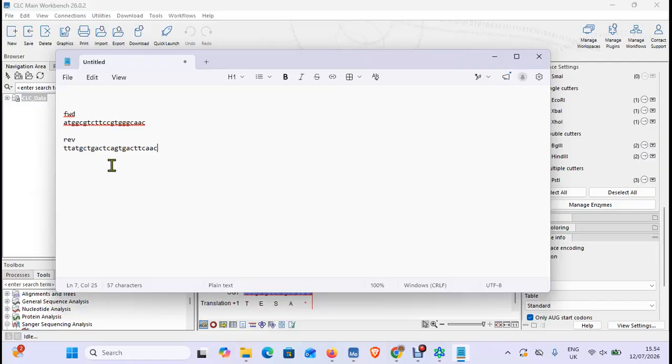The primers are not quite ready for their time in the sun because we still need to add the restriction sites. And yes, it is not normal to have all the restriction sites memorized. Trust me, this comes through bitter experience, which is okay, is optional, don't worry. And I still check my work.